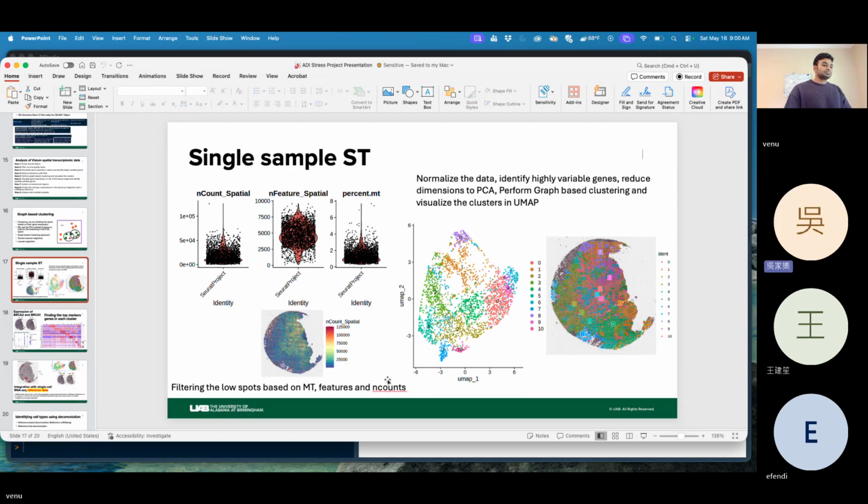The diagram on the right hand side, the left one is, well, you have spots with similar color, like the lower bottom of the rightmost image is green. So that means those refer to the same spatial region where the genes exhibit similar gene expression. Is that correct? Yes, that is correct. You are absolutely correct.